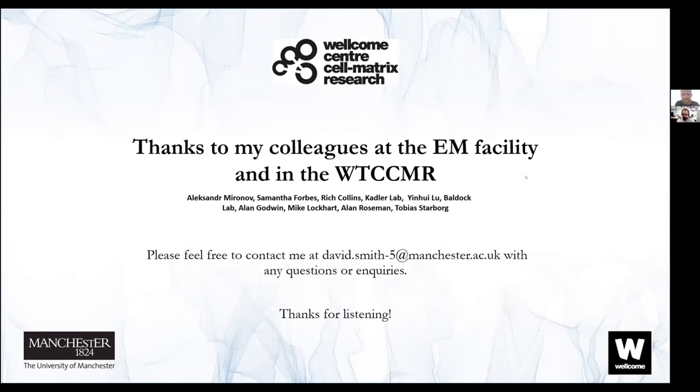I think Alan asked about rotary shadowing for visualization of DNA and RNA. Yeah, of course it's possible, but then it will be just flat, and there are a lot of peculiarities and artifacts with rotary shadowing. It can only be done on a very flat surface, and of course shadowing itself decreases the resolution. It can show shape, but you need a very clean sample, because anything you put in the shadow will be shadowed. So any garbage around, you will see it, and it can obscure the real sample.